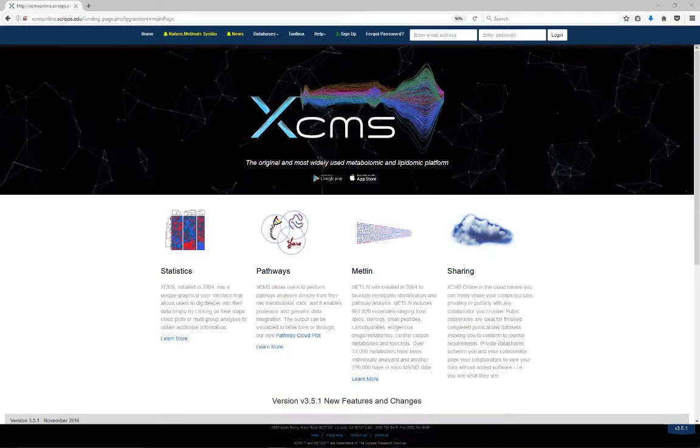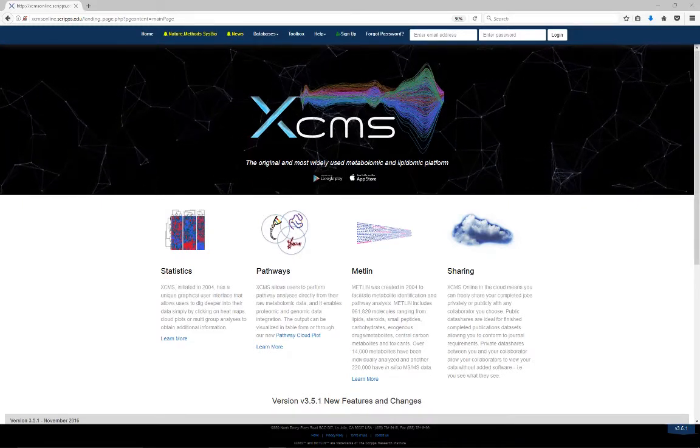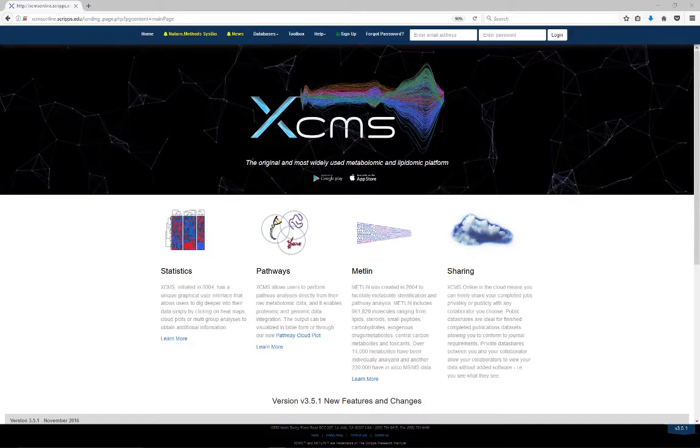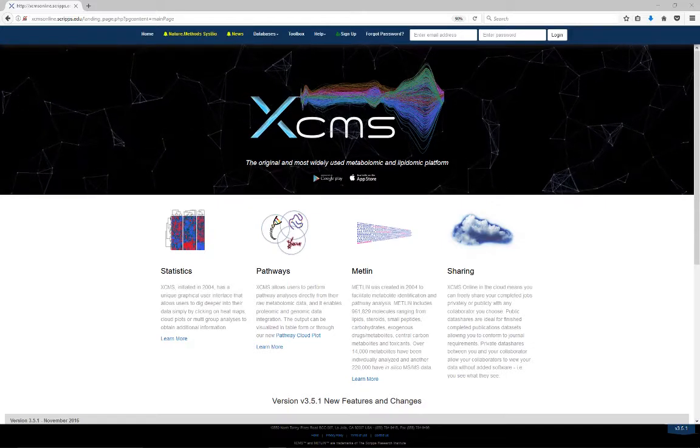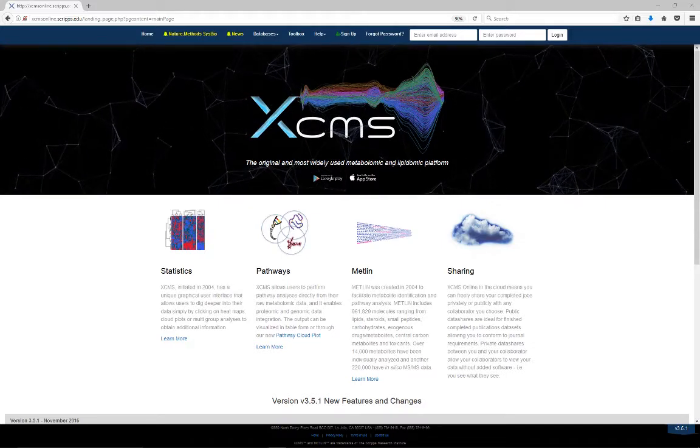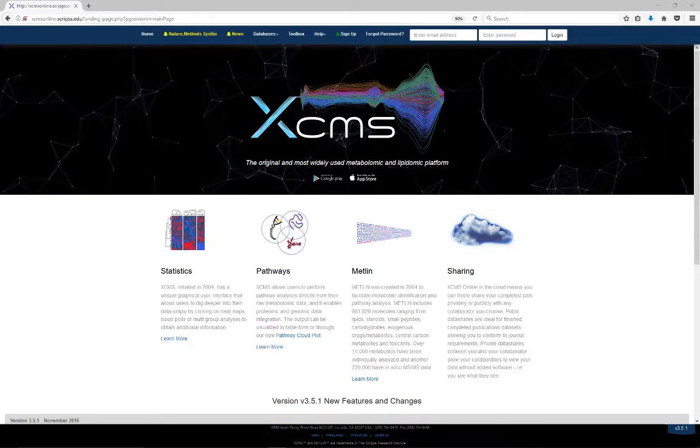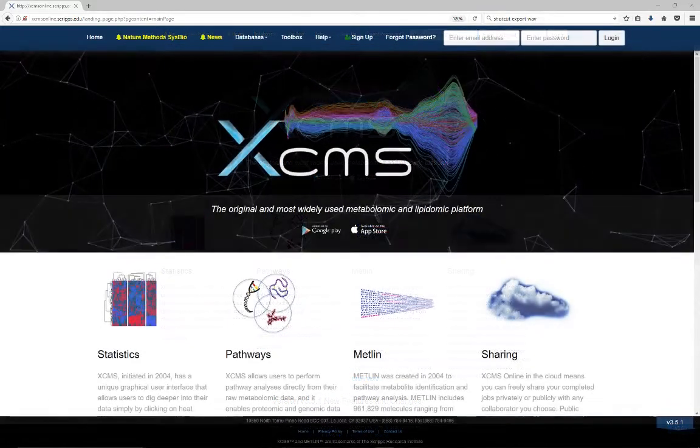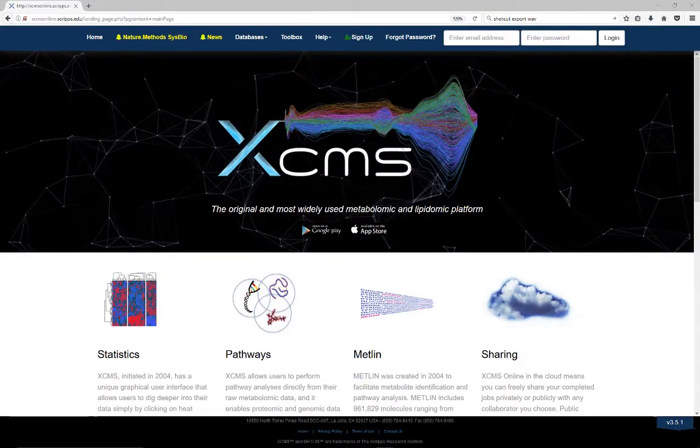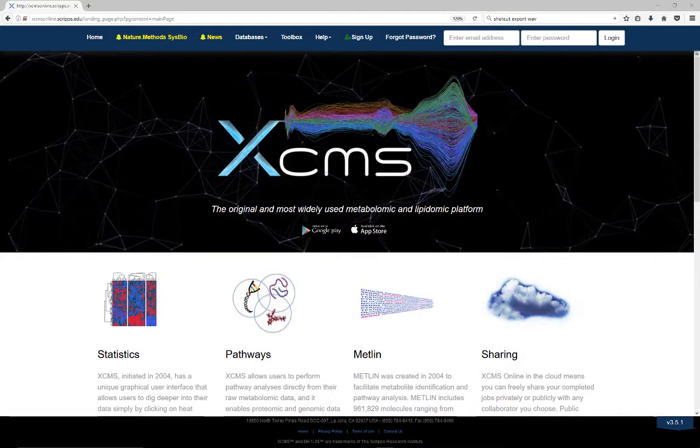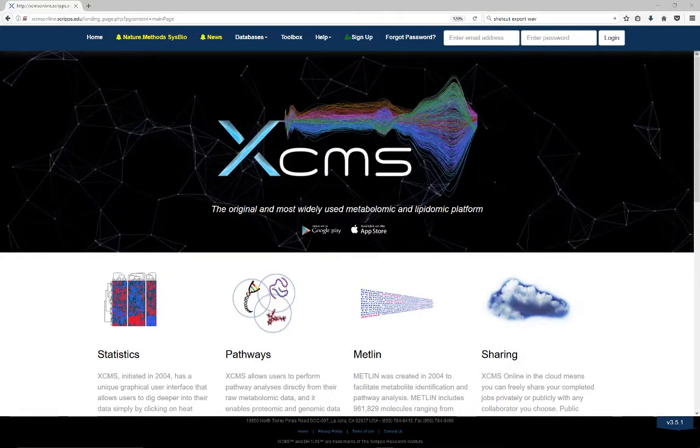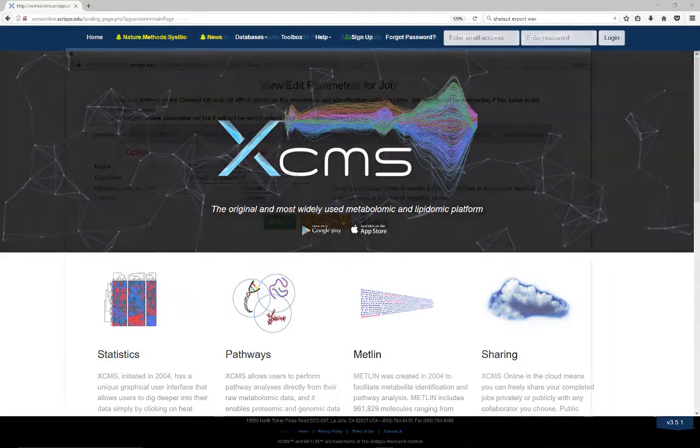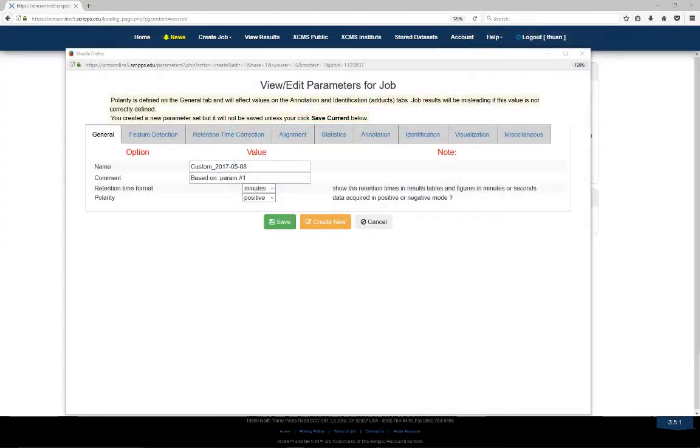Our systems biology analysis begins with a predictive pathway analysis that predicts dysregulated metabolic pathways directly from the accurate mass values of the features generated from the XCMS processor results.